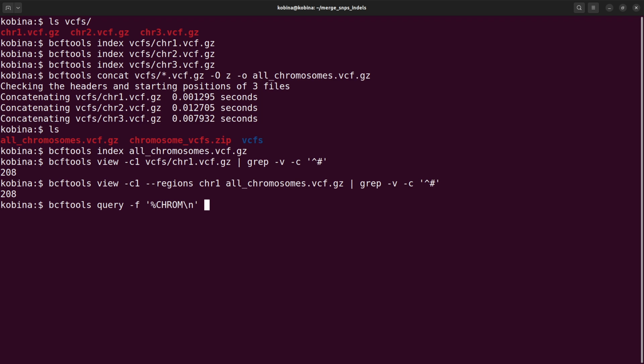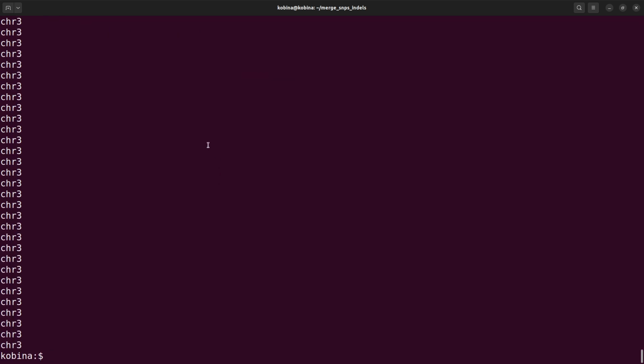Let's say all chromosomes, or you can use any of the VCF files, that's fine. And then you can just execute it. So that will let you know the chromosomes you have. So here I have all these.